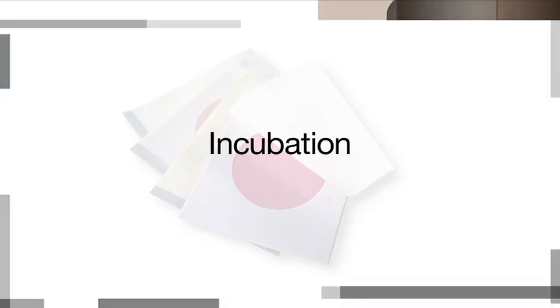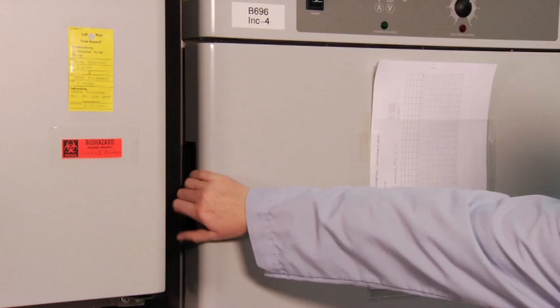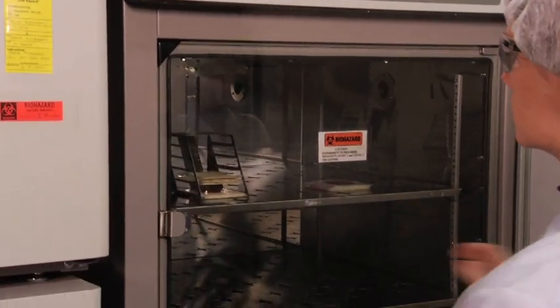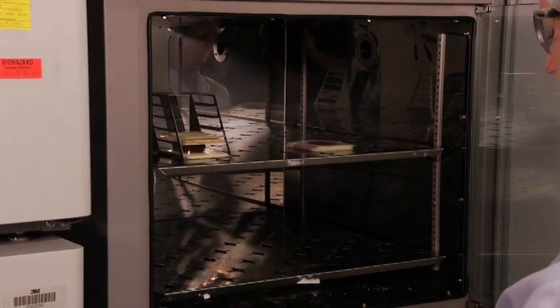Now, let's talk about incubation. Incubate 3M PetriFilm E. coli coliform count plates with the clear film side up, in stacks of up to 20.